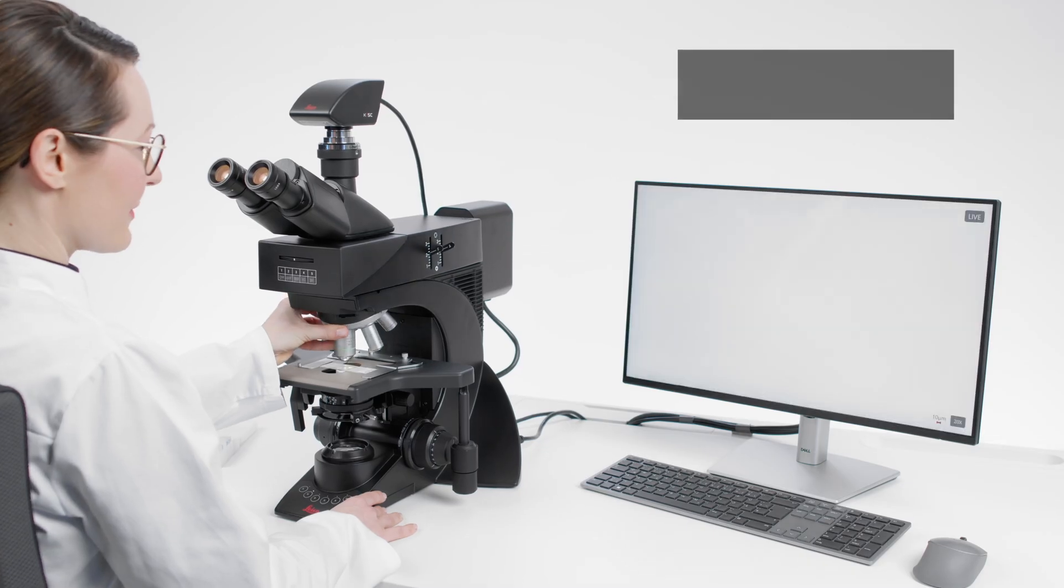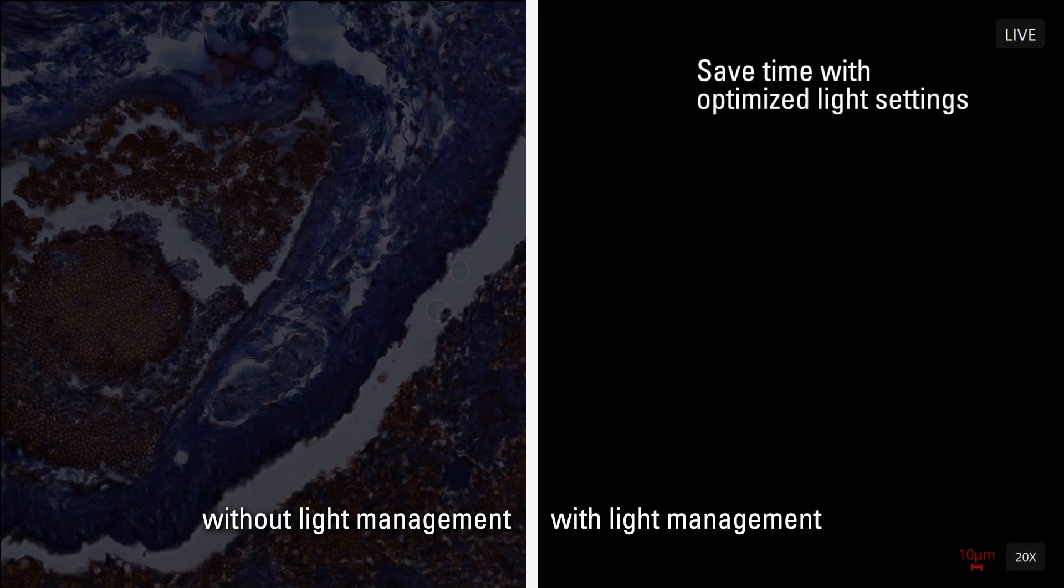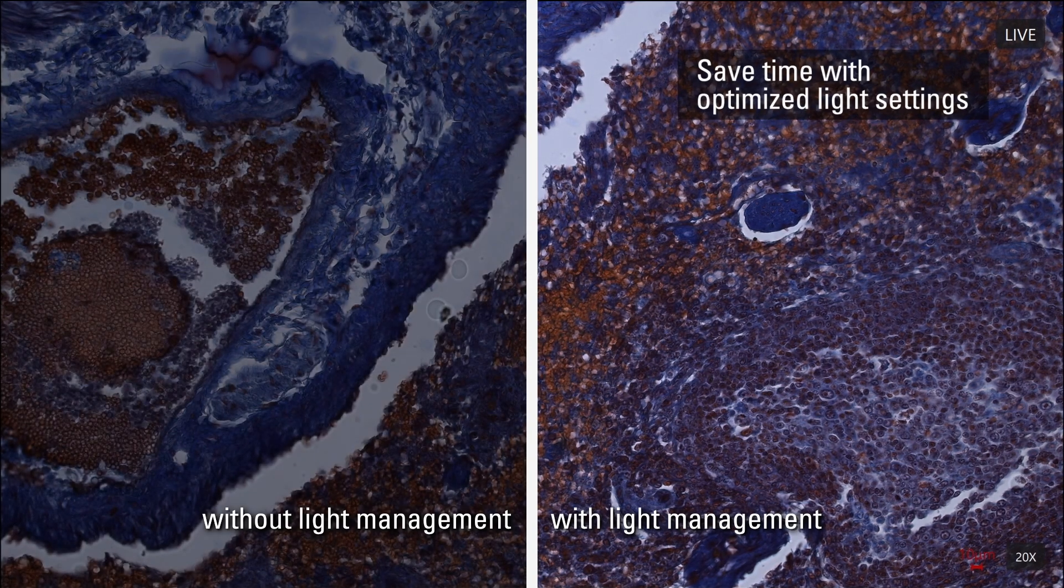Use your time to observe a specimen with optimal illumination without the need to adjust the microscope's light settings thanks to the light management function.